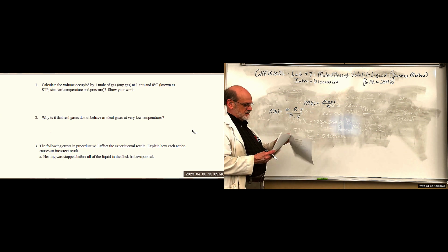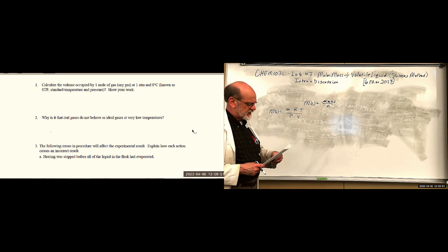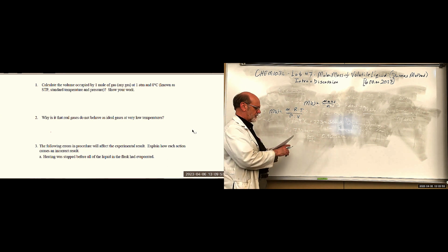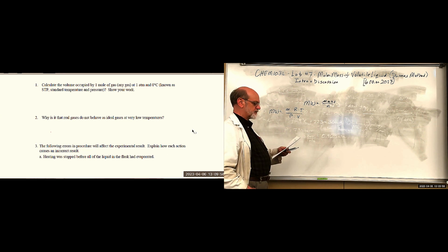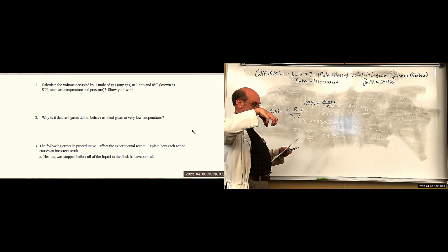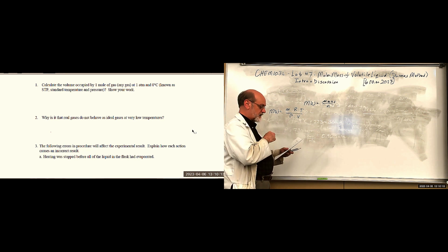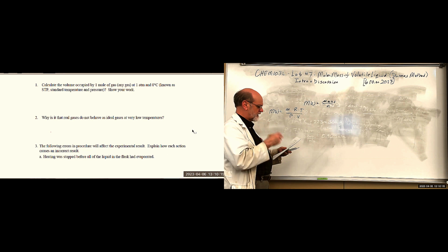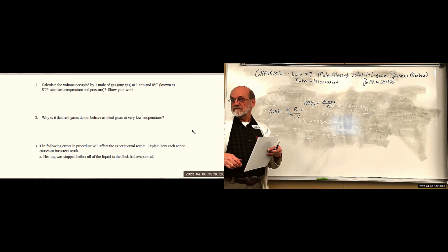All right. Let's see, 4. A student has an unknown liquid and determines its molar mass by collecting data as described in this experiment. So the mass of the Erlenmeyer flask is 79.621. This is with the foil and the copper wire, the inner foil, the smaller one. And the mass of the cool flask containing the condensed liquid is this value. So what's the mass of the flask? Just take the difference.